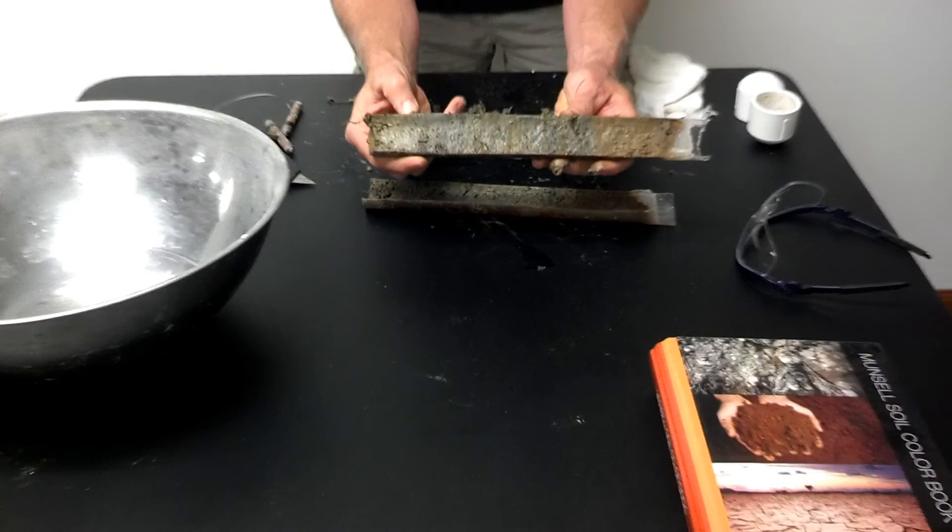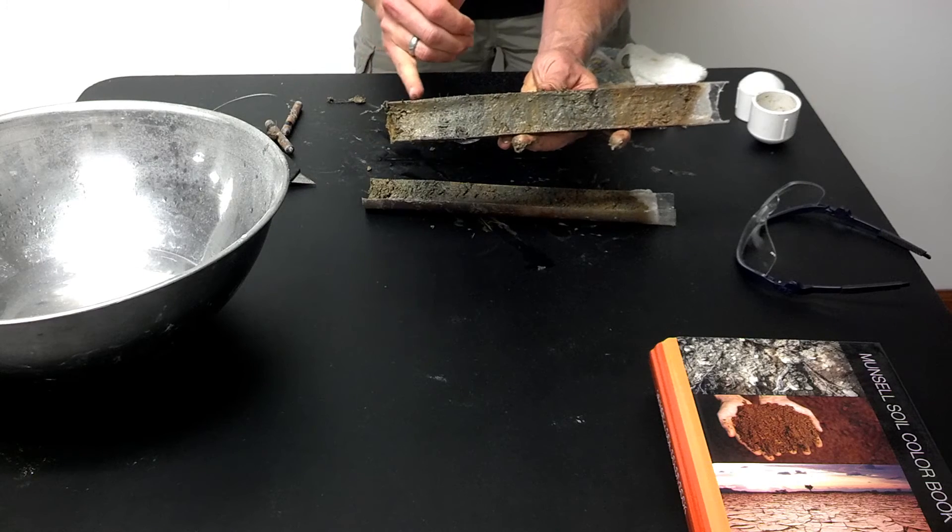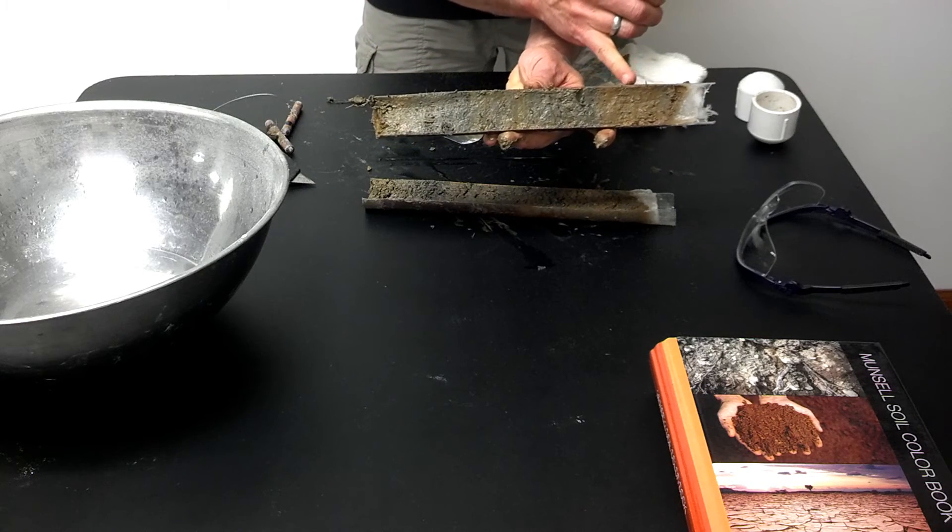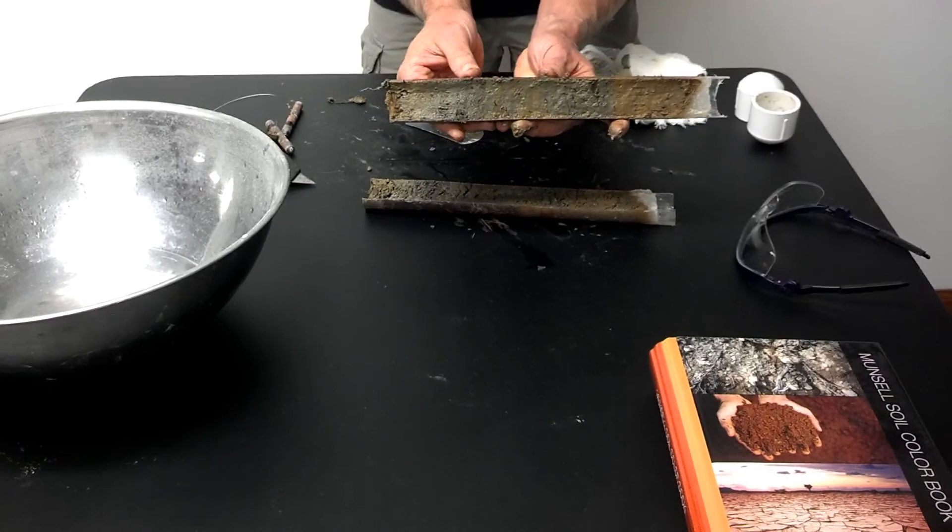Now with the surface scraped, we can see finer layering within the sample itself. We'll start to look at these different layers and see if they can tell us about the history of what the lake was doing when these different sediment layers were deposited.